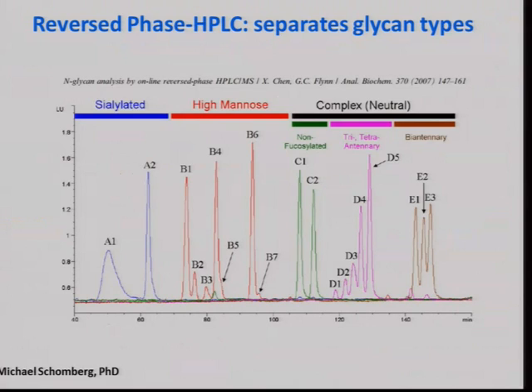Now, it's okay. I would say we've looked at it a lot of times and we don't use it because it's very heat sensitive. So if you have a pre-column heater, you get a different separation order from if you don't have a pre-column heater, and it's just much less robust for us anyway. So we had a long project with Roche. We worked out how they could use it because for them it's a good idea, but for a first approach, I wouldn't use reverse phase.